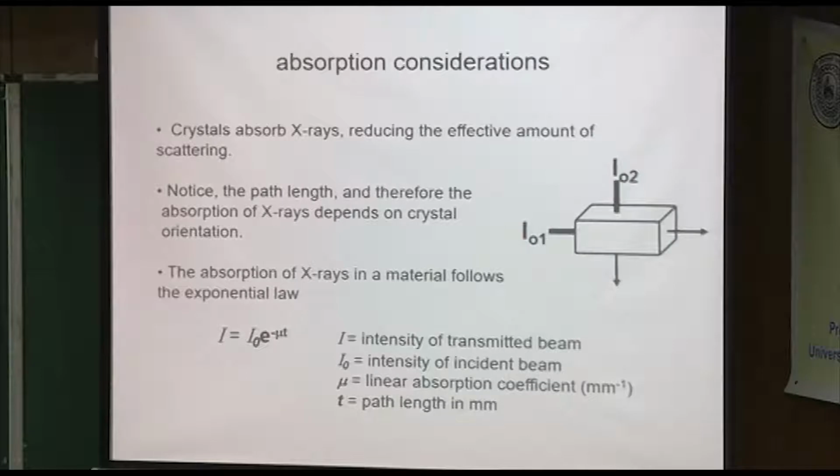And if you have a dual instrument, you can switch back and forth in minutes, as opposed to the whole day that it used to take if you switched the whole tube out and realigned it and exposed yourself to X-rays in the process. You don't have to do that anymore. So if you're ever in a position to advise on the choice of a new instrument, say, we want a dual instrument. Everyone loves them.